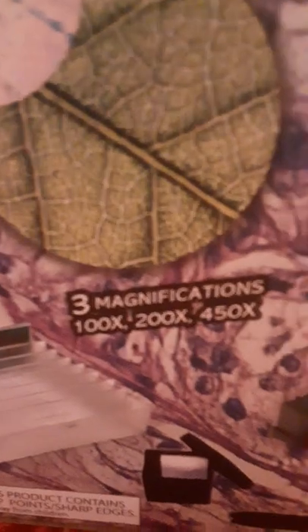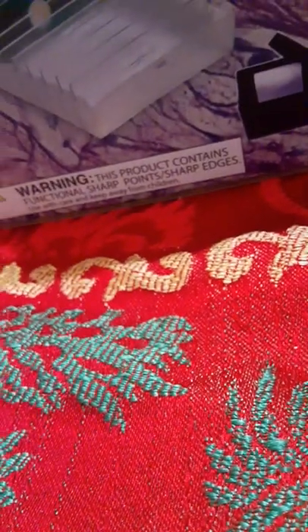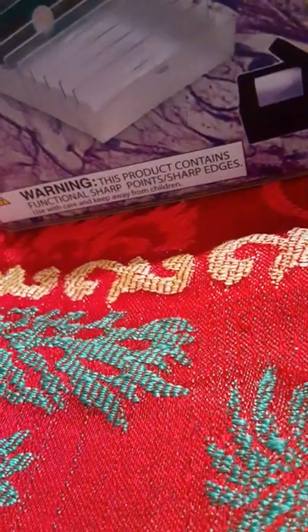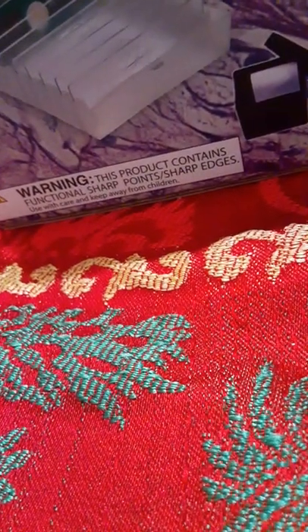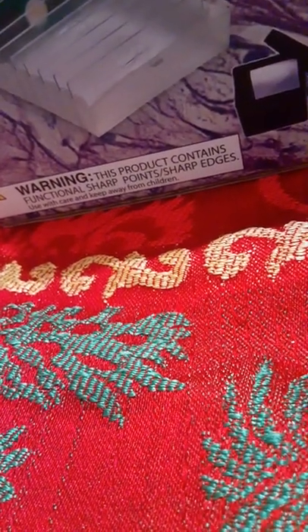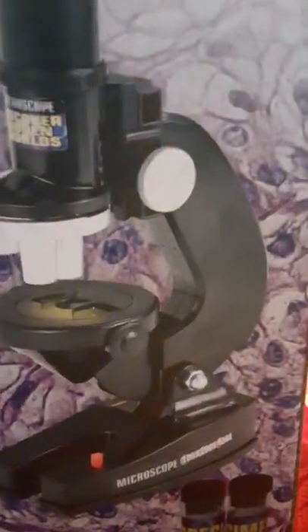This microscope has three magnifications: 100x, 200x, and 450x. Plus, this is only for eight and up, which I am, basically 11, even though I don't sound like it. This product contains functional sharp points and sharp edges. So it is what it looks like, it's not a ripoff. I didn't get this from Goodwill, I got this from Five Below. Let's unbox this.